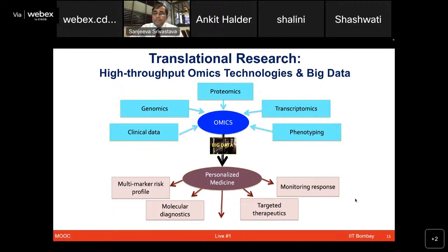There are many omics technologies which by now you are familiar with: you are looking at gene level information in genomics, mRNA transcript information in transcriptomics, and protein based information in proteomics. Of course, if you are looking at biological or clinical samples, you look at clinical features and add that information to look at phenotyping, which could also be clubbed into metabolomics. And all of this information generates the big data sphere, which you can club as big data.